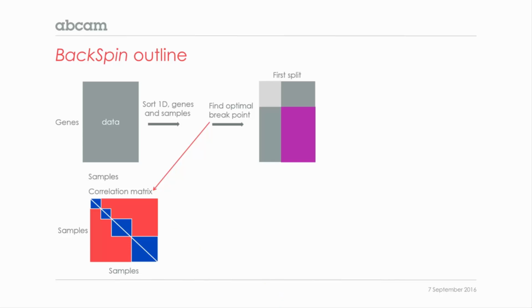Then after you split this set of cells, this data, into 2 chunks, you can also divide the genes into the genes that are more specific or most relevant to the first chunk, on the left, or the second chunk on the right. And what you get is basically a group of cells, again, on the column, and a group of relevant genes, and a second group of cells with a second group of relevant genes.